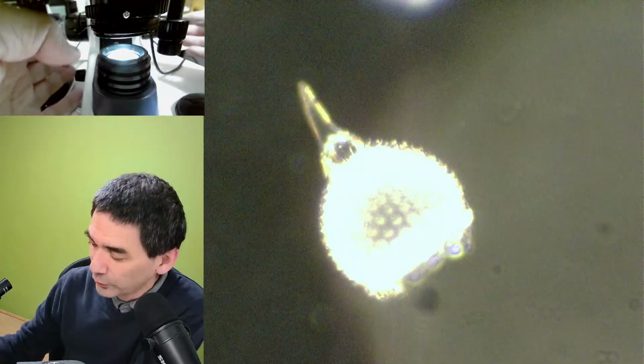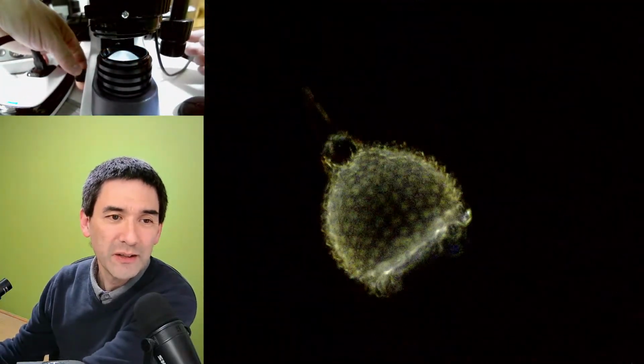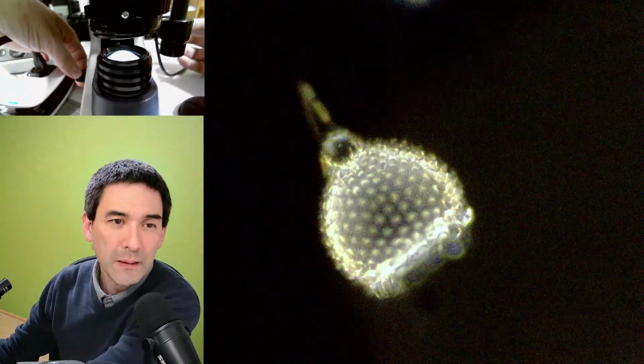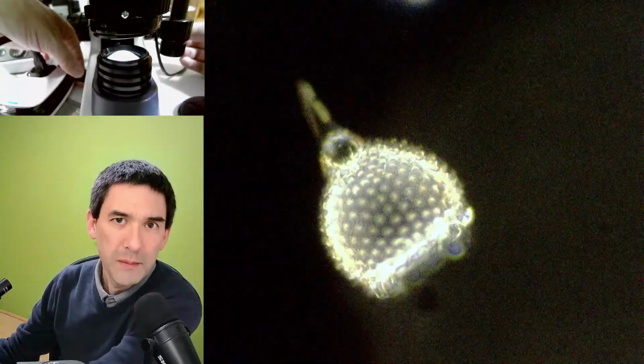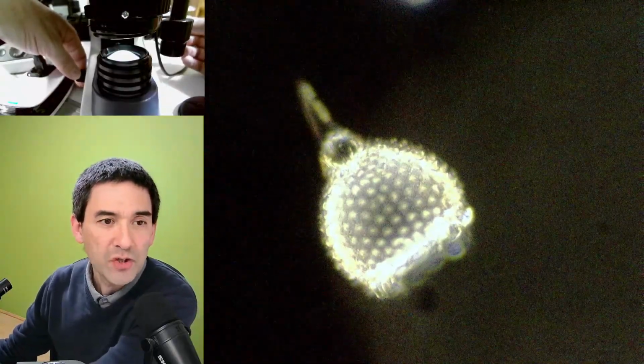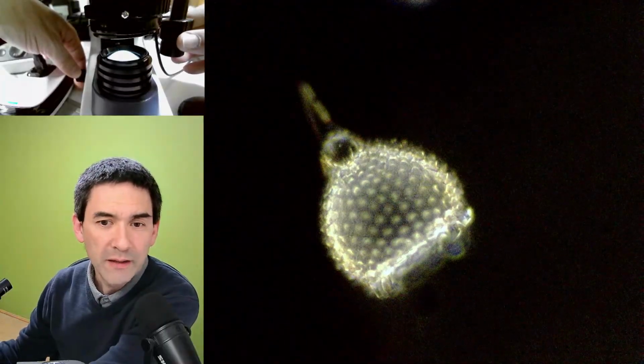Unfortunately, I need to reduce the light here. It looks a little bit overexposed because of the camera. But in dark field, maybe that's also one of the disadvantages. Dark field gives you a very strong contrast. Right now this is a little bit of a camera problem.